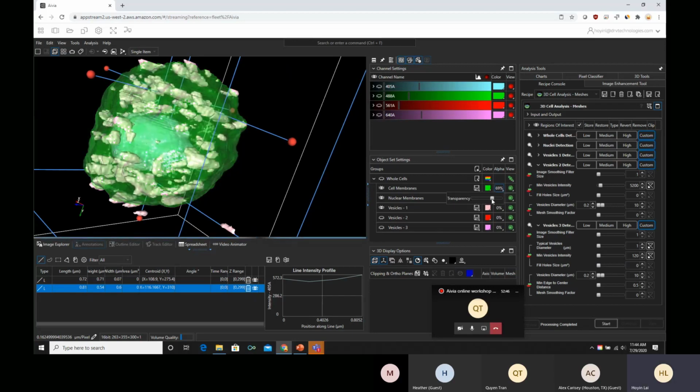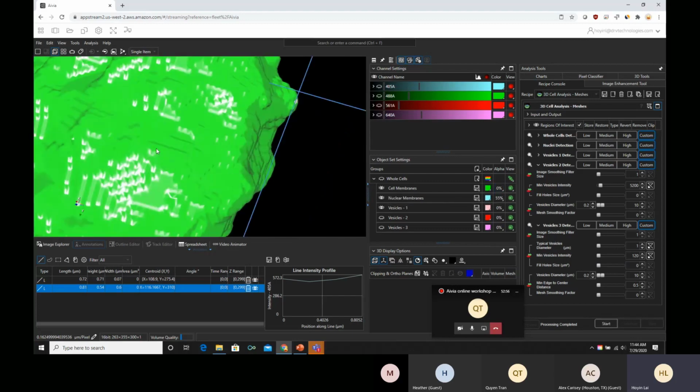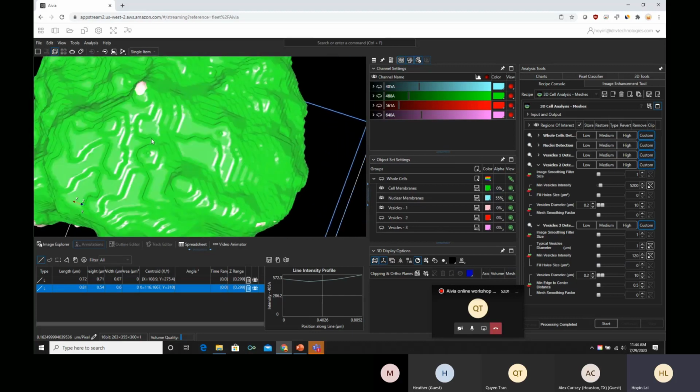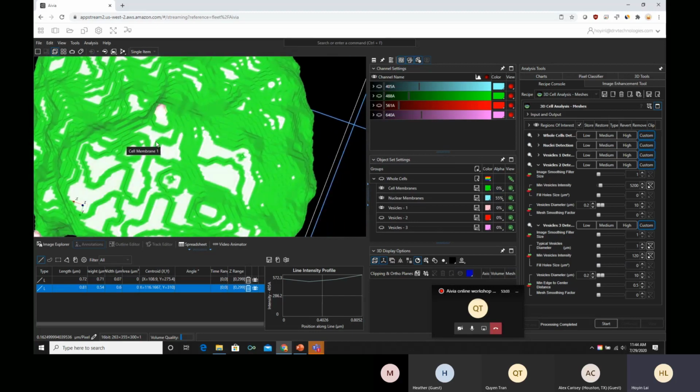One thing that would be good when it comes to the analysis is that you notice the object looks very blocky in the result. If you have ever played Minecraft or SimCity 2000, everything looks like there's a flat level, and then it slopes down and slopes down, so it looks very blocky.